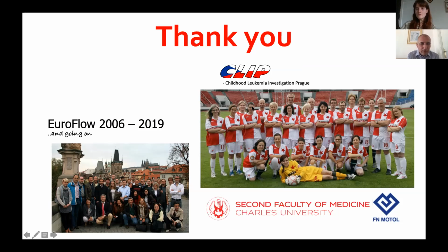And if your assay is not affected by small changes in compensation matrix, I would think test and then make your decision whether it's good enough or not. And if it's good enough, I think it's safe to use it. But don't trust it blindly.